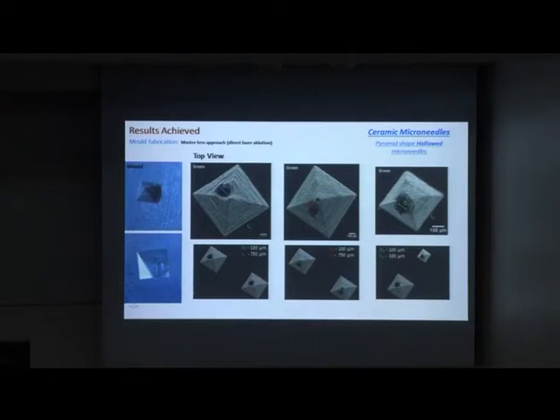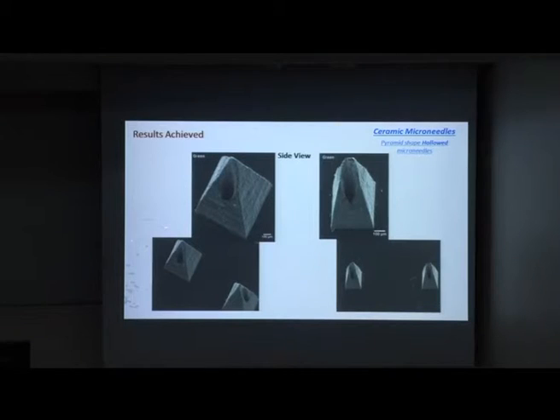So these are top view photographs in green state. You need to take into account that this will shrink after sintering. And these are side view photographs of the microneedle. So the length of this is around 1 millimeter also. The whole size, as I said, around 100 micrometers.